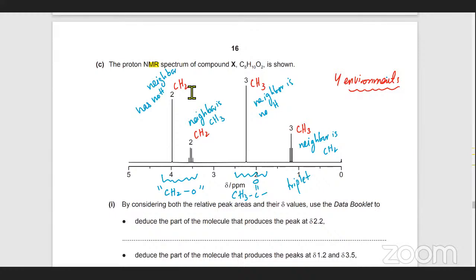How is that possible? It's probably possible that there is CH2 और फिर बीच में एक ऑक्सीजन पड़ा हुआ है, फिर बीच में there's another CH2, right? So that's how both CH2s could end up in this configuration next to O, right?